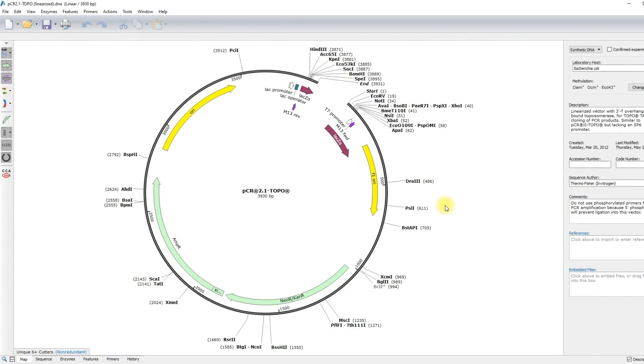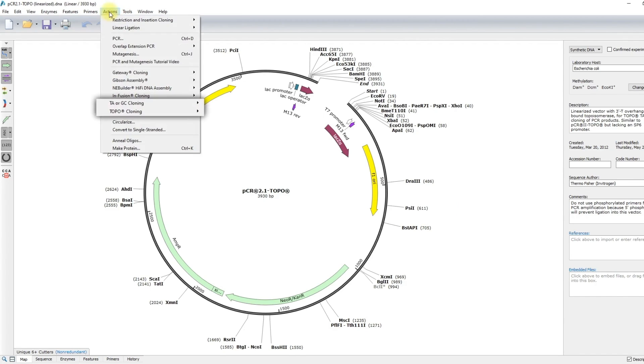Sequences of TA and topo-TA vectors are included in SnapGene and can be found by opening the Actions menu and selecting TA or topo-TA cloning.